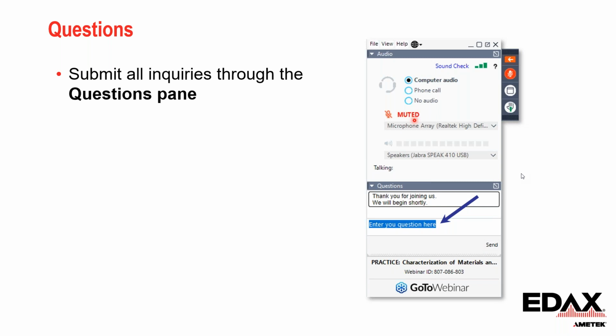So I would recommend a field emission SEM, and I do not recommend using a tungsten SEM due to the issues of beam stability, especially at high beam currents. Usually for the tungsten SEM, the beam stability at high currents is typically quite poor.